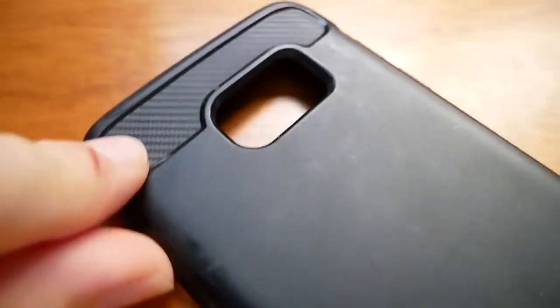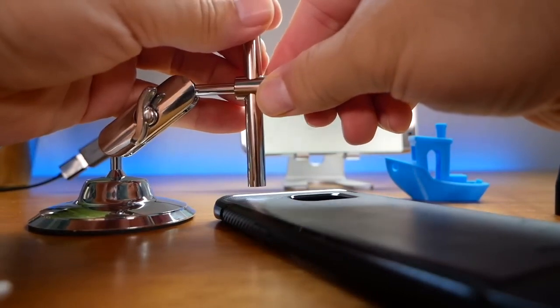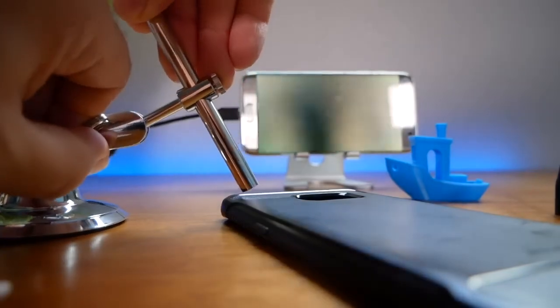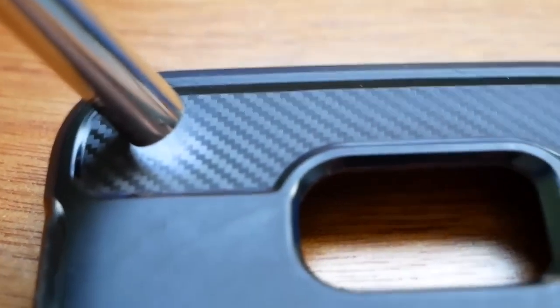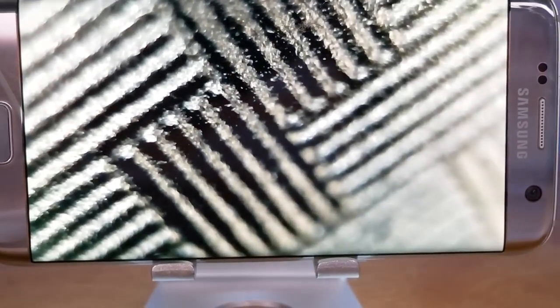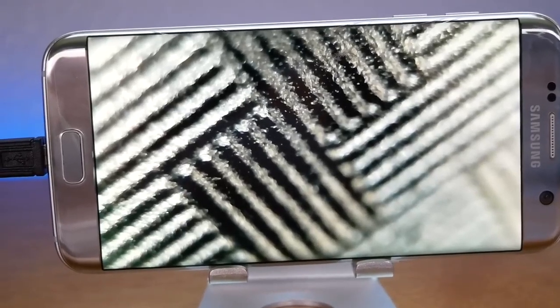Here's my phone case — I'm wondering if we can look at what appears to be carbon fiber, not sure if that's real or not, but curious what it looks like. I raise the scope and lower it slowly until I can see the fibers. You can actually see the carbon fiber — the individual little strands of however that was made. You can see this is what it looks like to your eye versus what it looks like under the microscope. Pretty amazing how you can see the individual little lines up close.